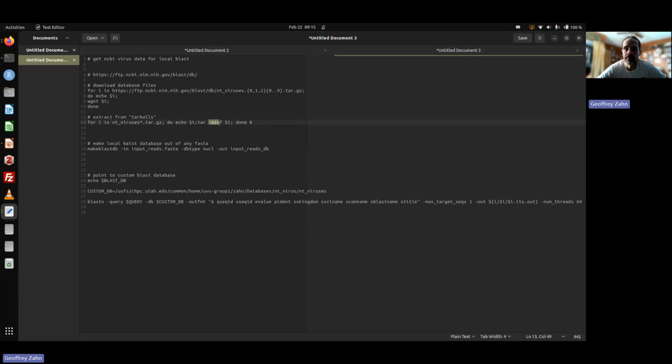So 90% of the time when I'm using tar, I'm either sticking files together or mostly I'm extracting other people's files. And so I've just got xzvf memorized and type it really quickly. But I think of it as somebody in a German accent saying, extract the file.